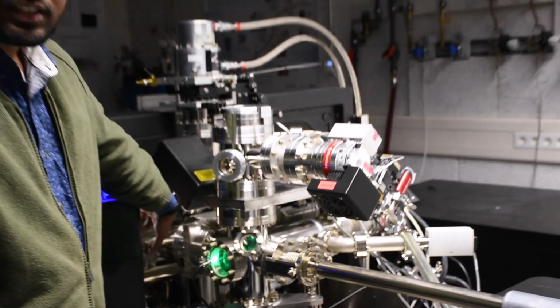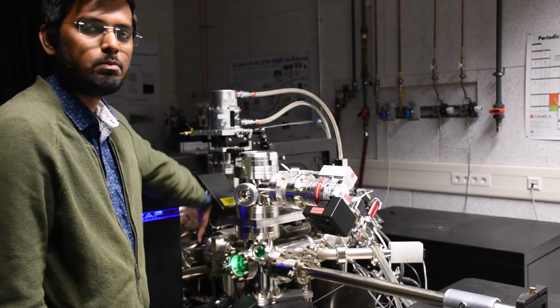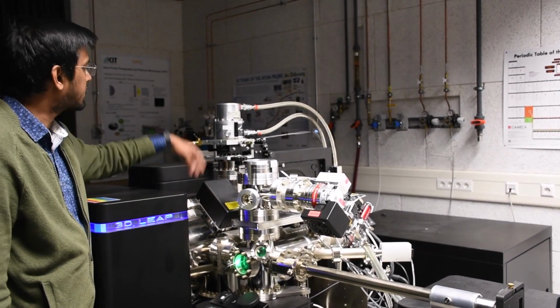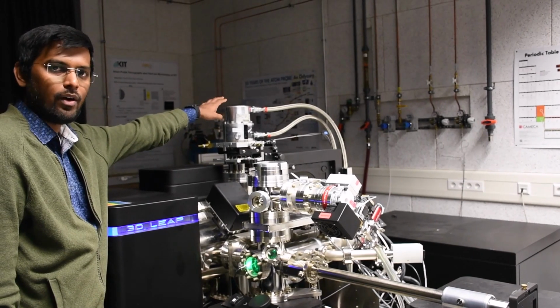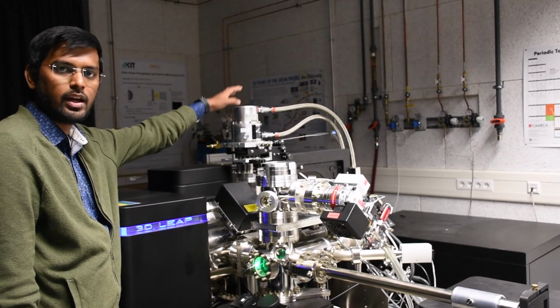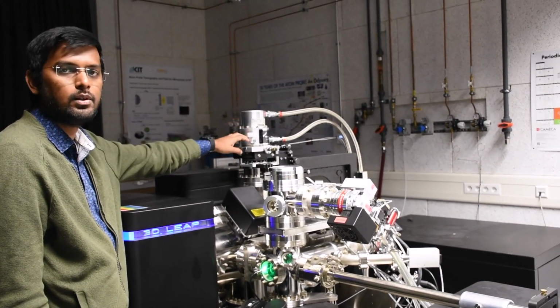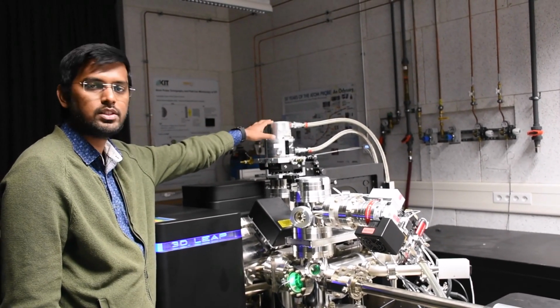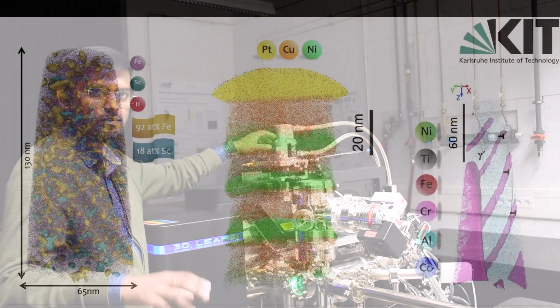And inside the analysis chamber, the pressure is around 10^-11 torr, and we cool our sample using this cryo head. This is the cryo head which compresses helium so that it can cool down the sample to temperatures of 30 to 40 Kelvin. And this is the guy which is making those rhythmic noises.